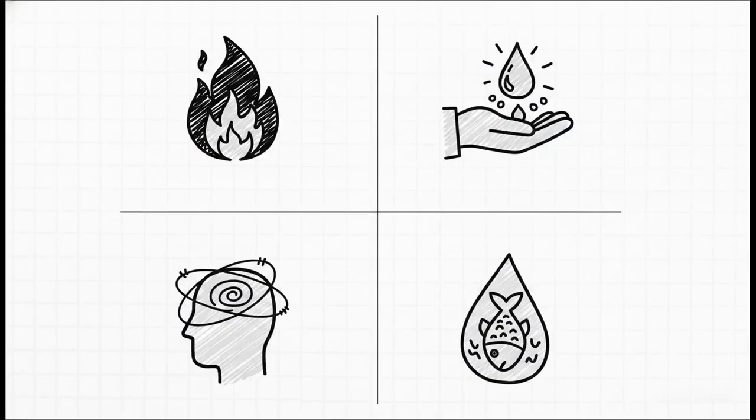So let's look at a few of these in the wild. You might see H226 on a label. That tells you it's a fire risk. H314 is a serious warning about chemical burns. H336 is about a health risk if you breathe it in, and H411 tells you it's bad for the environment. See, each code is a very specific, very important piece of the puzzle.